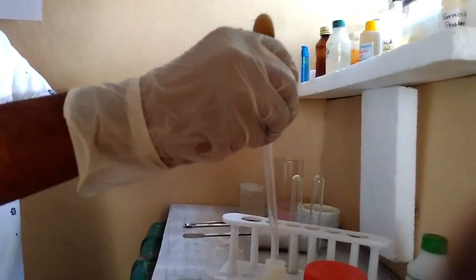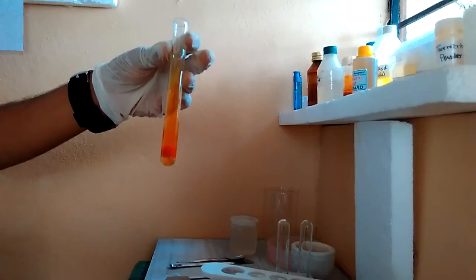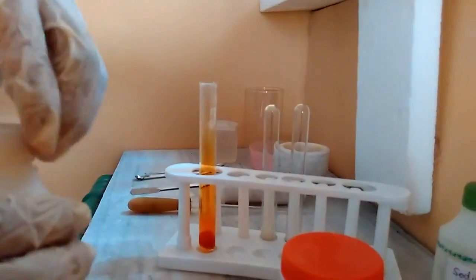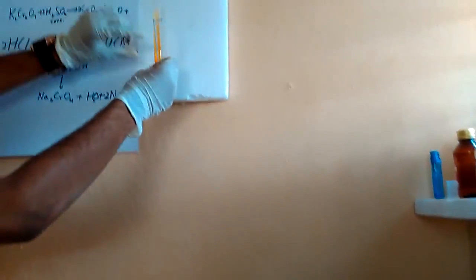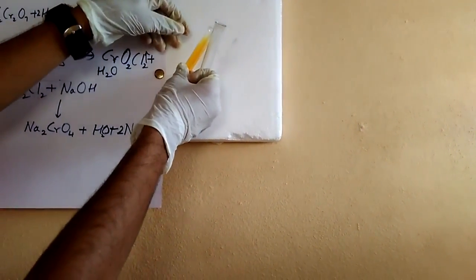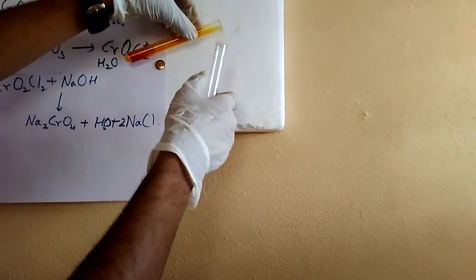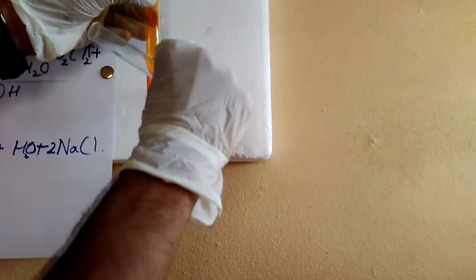You can see that a reddish-brown colored gas is produced. This is very much different from nitrogen dioxide. This chromyl chloride gas can be differentiated easily due to its characteristic color. If I put it on a white background, you could probably see it well. The gas is flowing out and has a very good reddish color. You can see that the gas has a good concentration at the bottom of the test tube.